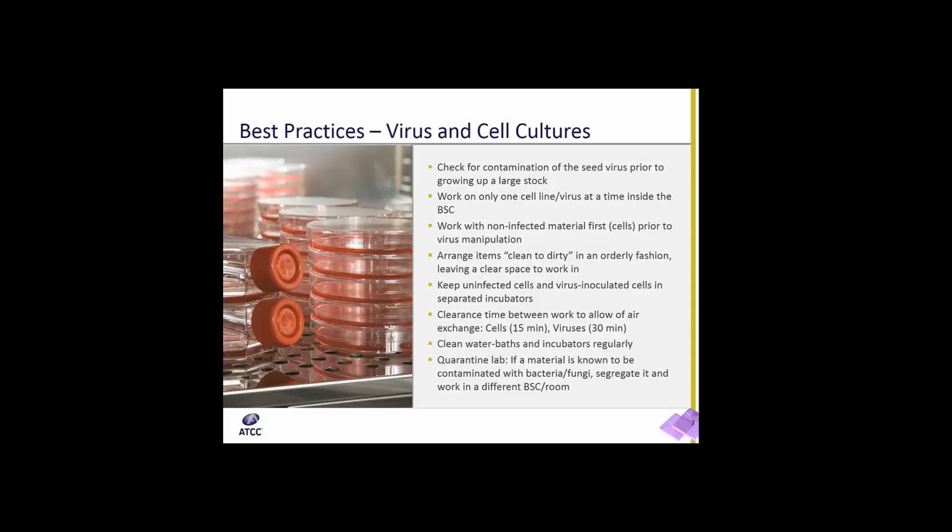Generally speaking, we use about 15 minutes when we work with cell culture and about 30 minutes when we are working with a virus. So if we are working with virus A, the work is done, give 30-minute clearance time before you work with virus B. Always remember to make sure your water baths and incubators are cleaned regularly, and have quarantine labs if possible in your facility, because when a material is known to be contaminated with bacteria or fungi, you would prefer to segregate and work with it in a different biosafety cabinet or a different room so that you're not contaminating other cultures that you may have going on in the lab.